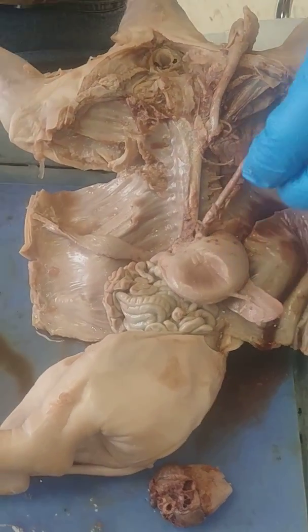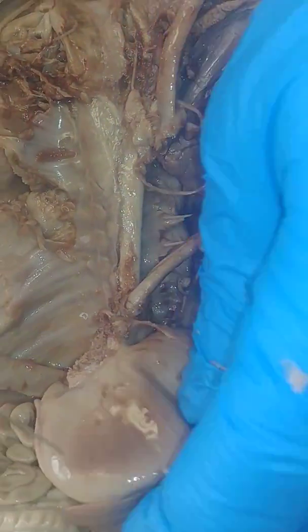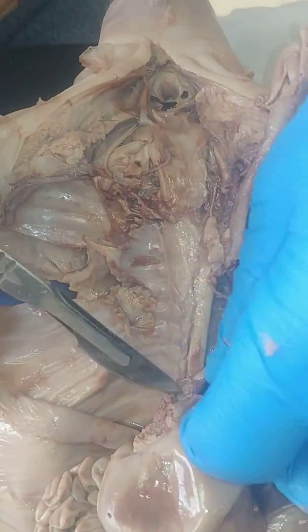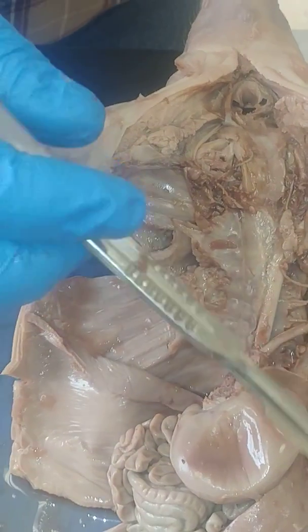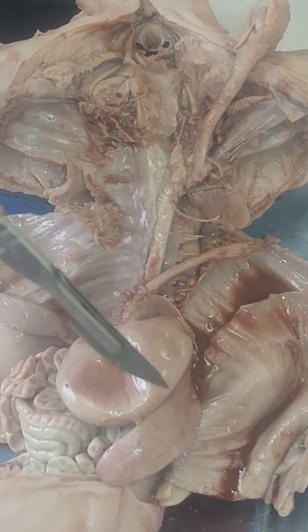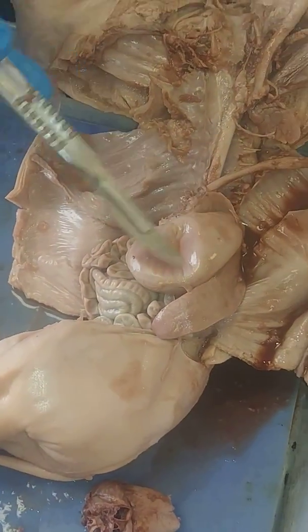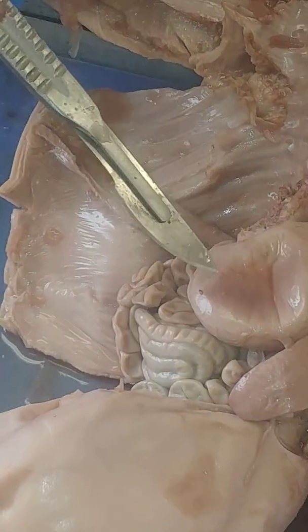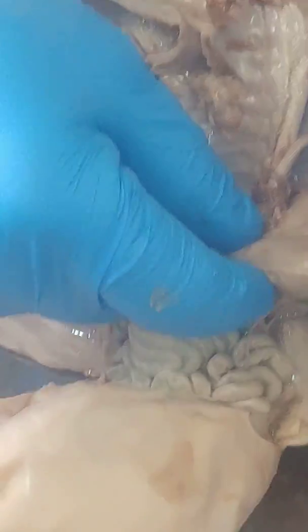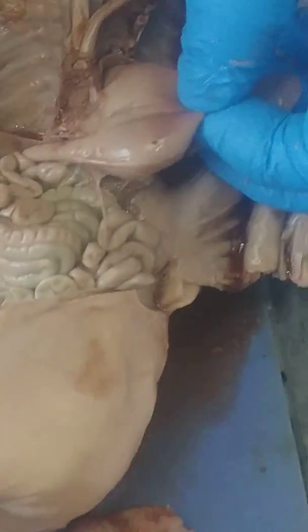So we got the liver out. And this was the esophagus traveling down through here. Here's your stomach, kind of in a J shape. And different sections of the stomach, right where the esophagus comes in, is called the cardia. This is the fundus. This part is really stretchable right here. So if you eat a lot of food, then the upper left part of your abdominal area will kind of bulge out a little bit right in here. And then you've got a big storage area down in here called the antrum. And then down towards the end in here is the pylorus. And there's a hard little knot-like structure here, little bundle of muscles called the pyloric sphincter.